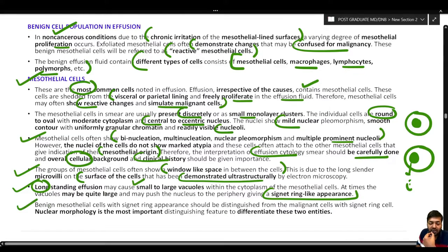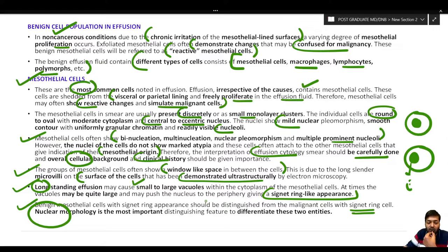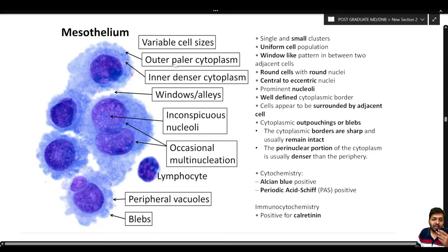Benign mesothelial cells with signet ring appearance must be distinguished from malignant cells also showing signet ring appearance. The most important differentiating factor is nuclear morphology: malignant signet ring cell nuclei are highly pleomorphic compared to the bland nucleus of benign mesothelial cells.